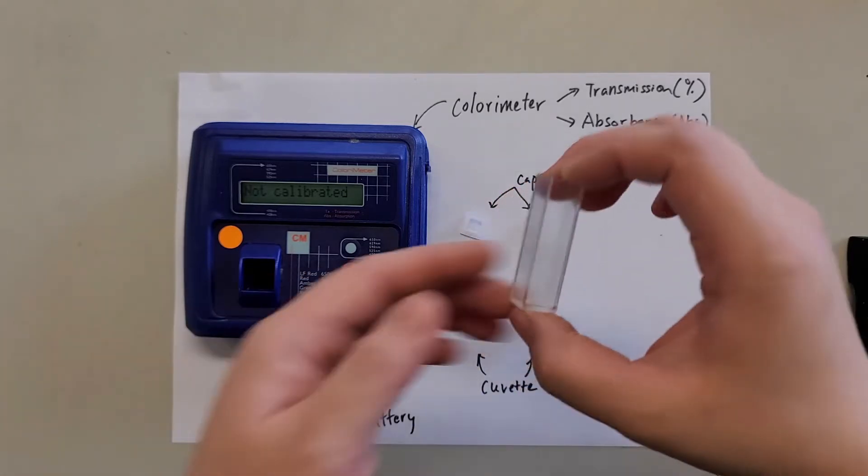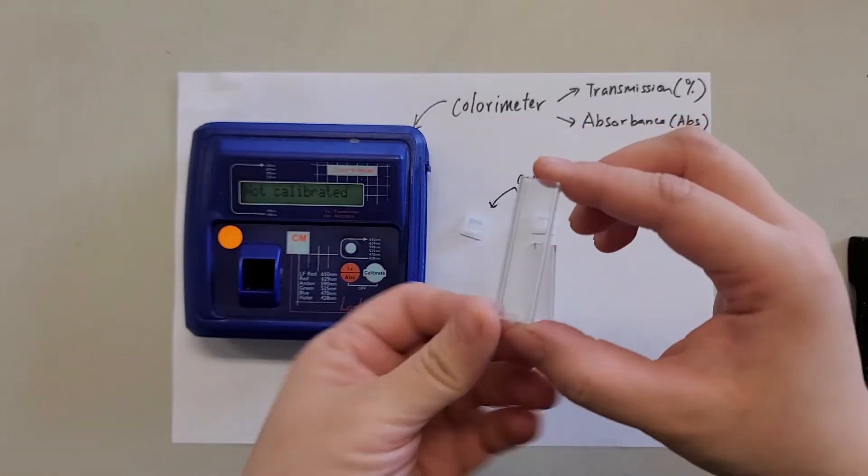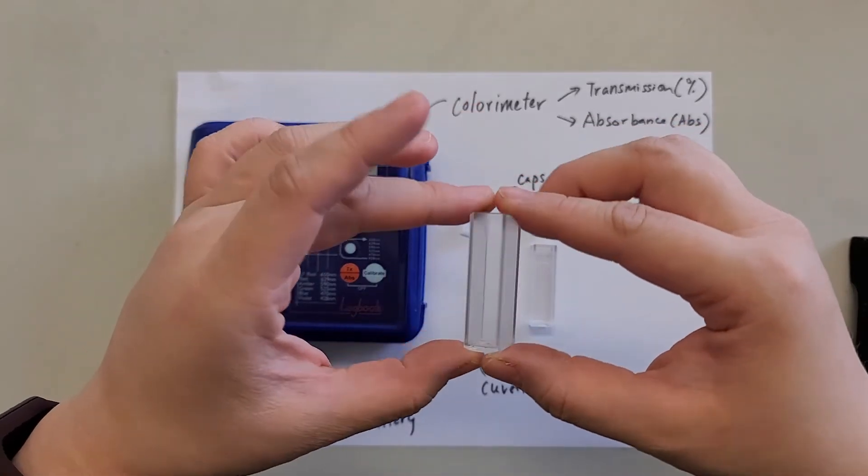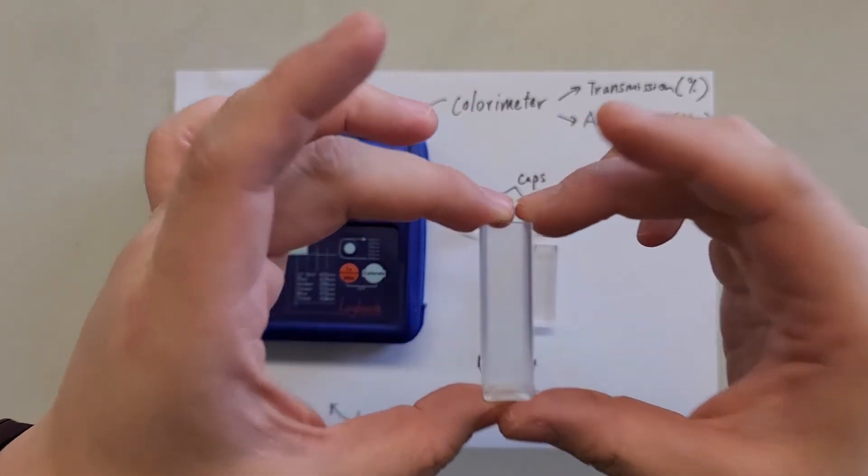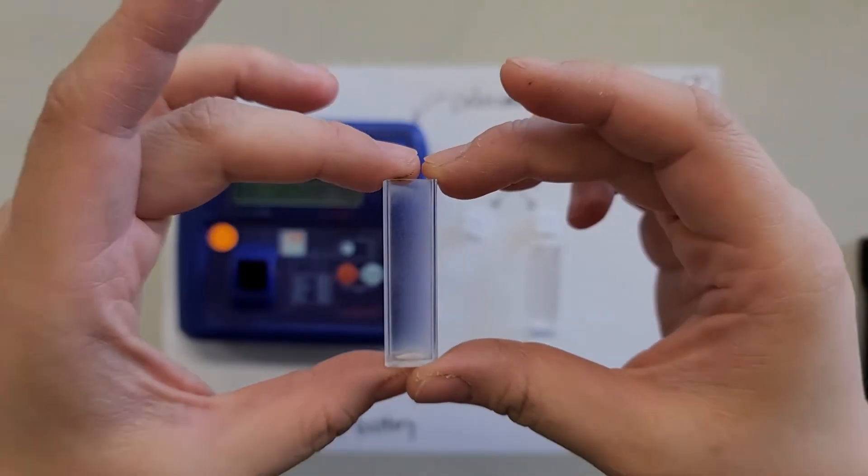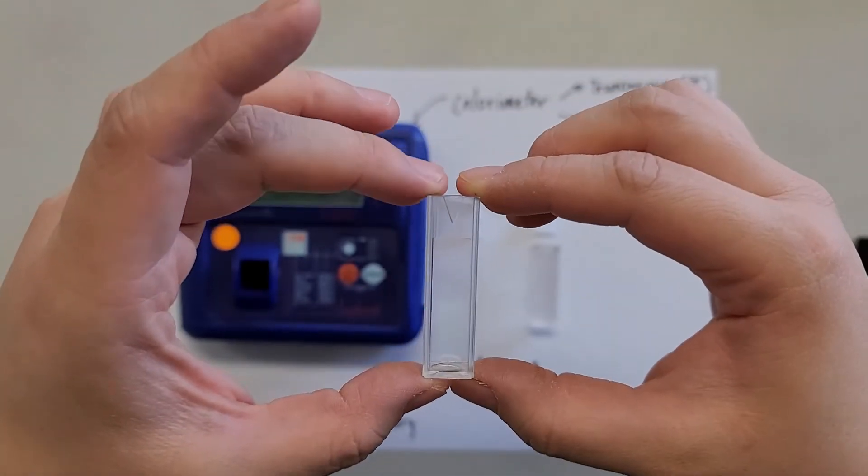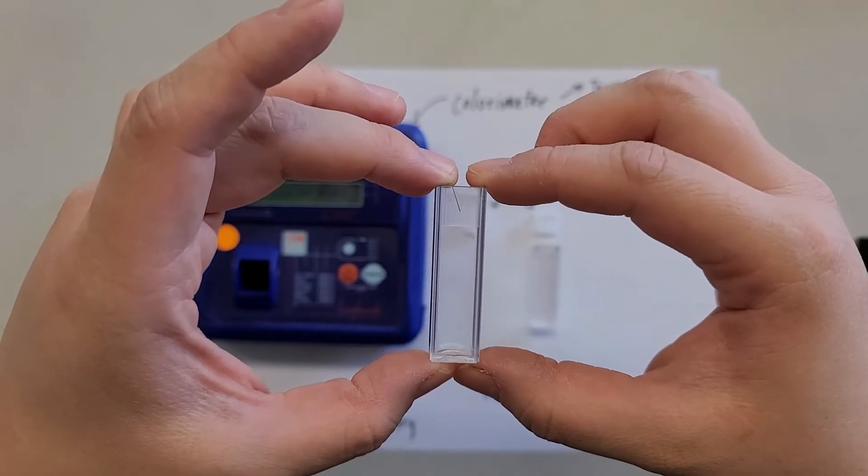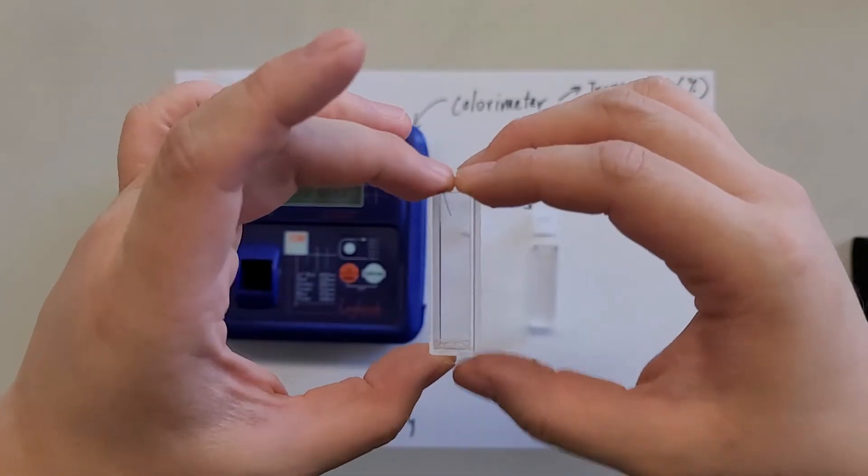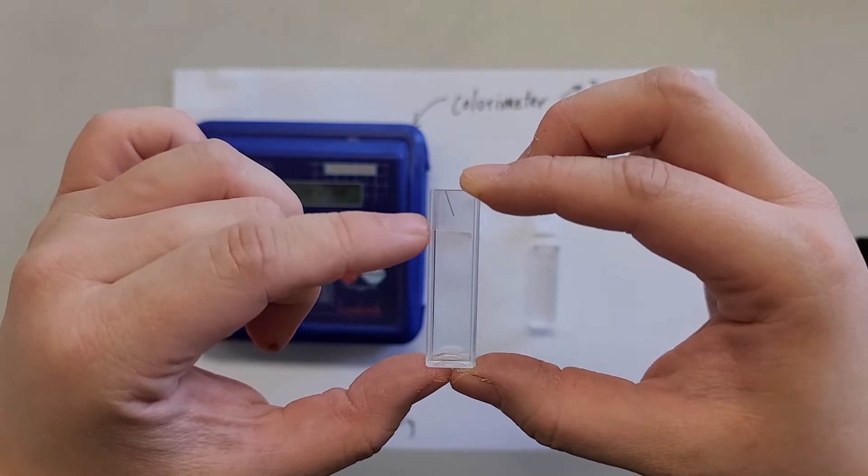So here is the cuvette. You will see that there will be two clear sides and two cloudy sides. Bring it a bit closer. Now this is the cloudy side. This side is the clear side. Generally speaking, the cuvette can hold about three mils of solution. Fill it up until to the line here.